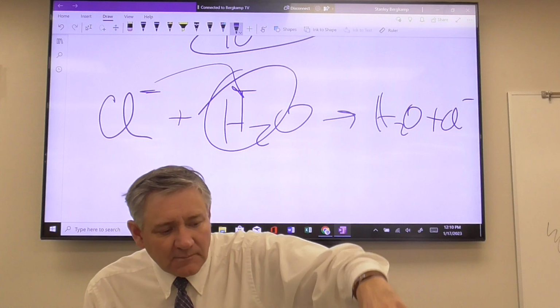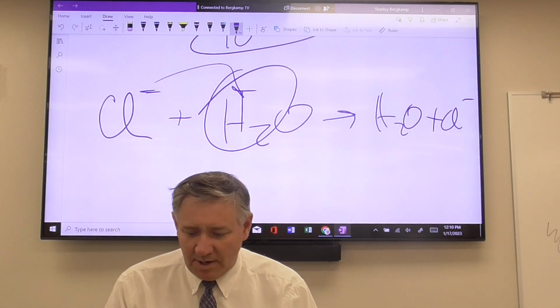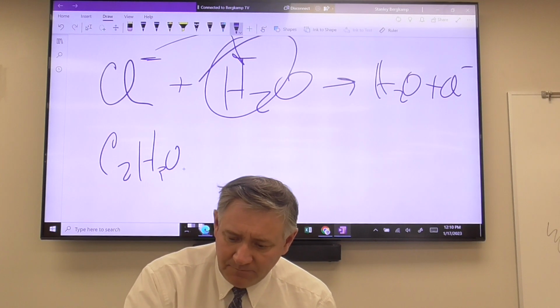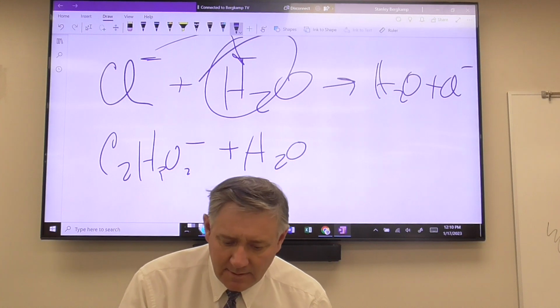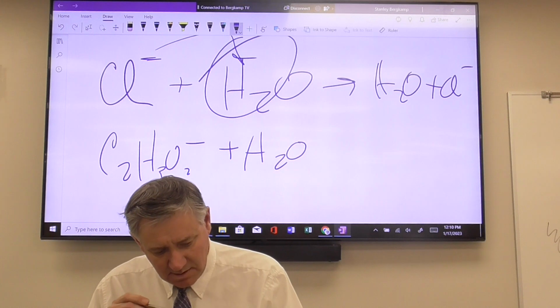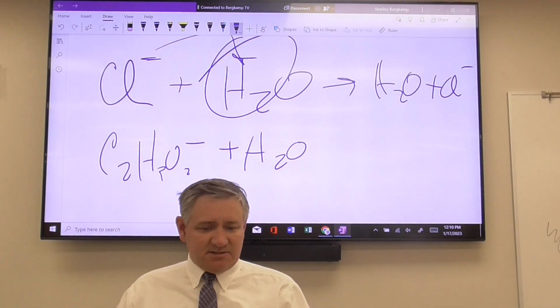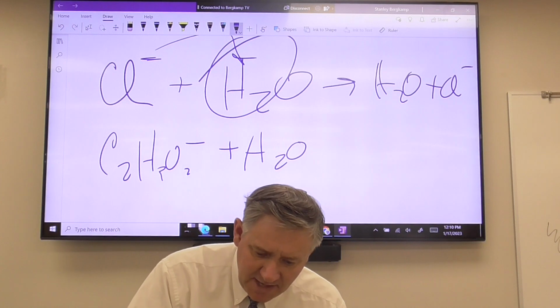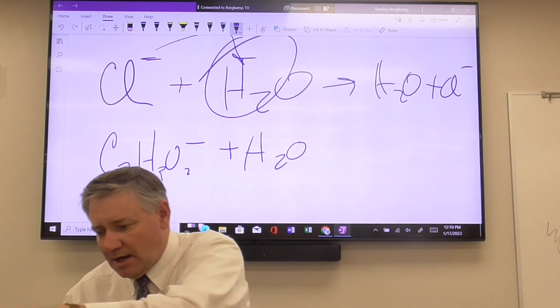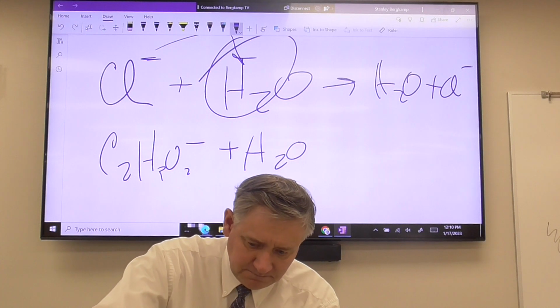However, now I'm going to take sodium acetate, also a salt, also a white powder, and put it in water. Now we're going to see what happens. I'm going to take about the same amount. Again, this is so imprecise. I'm going to put that in there, and then give that a stir with my pH probe, which is something you shouldn't do.